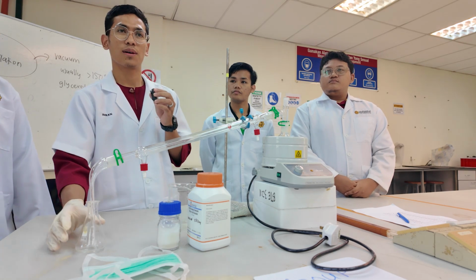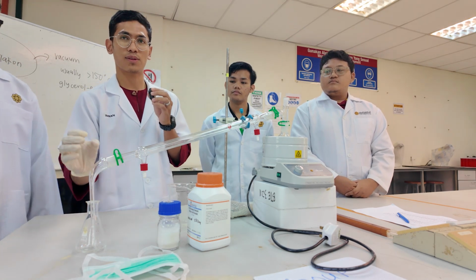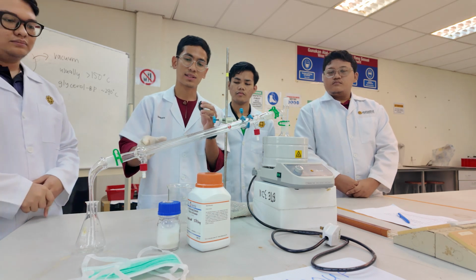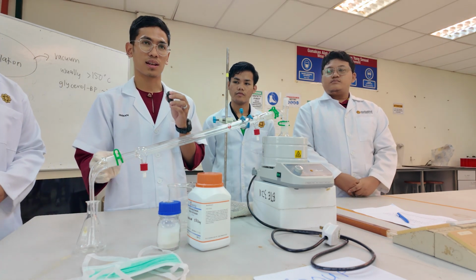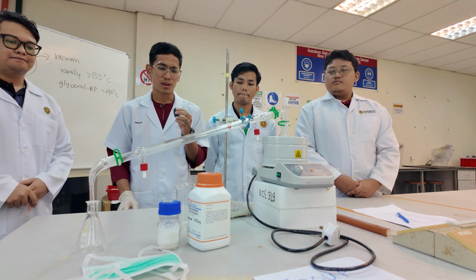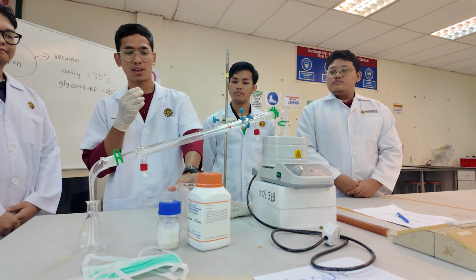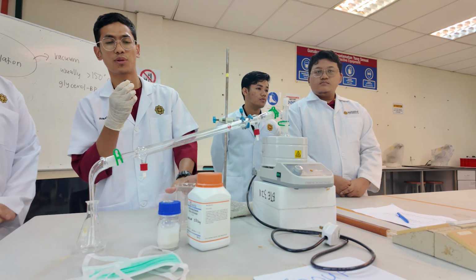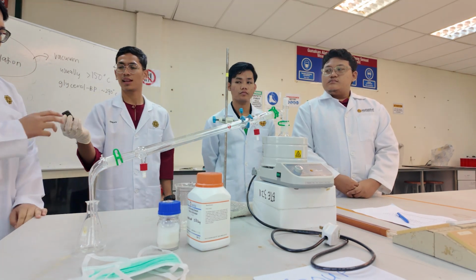We must set up slowly and steadily, and also emphasize checking for cracks in the glassware and make sure there are no cracks before doing the experiments. Okay, for next.